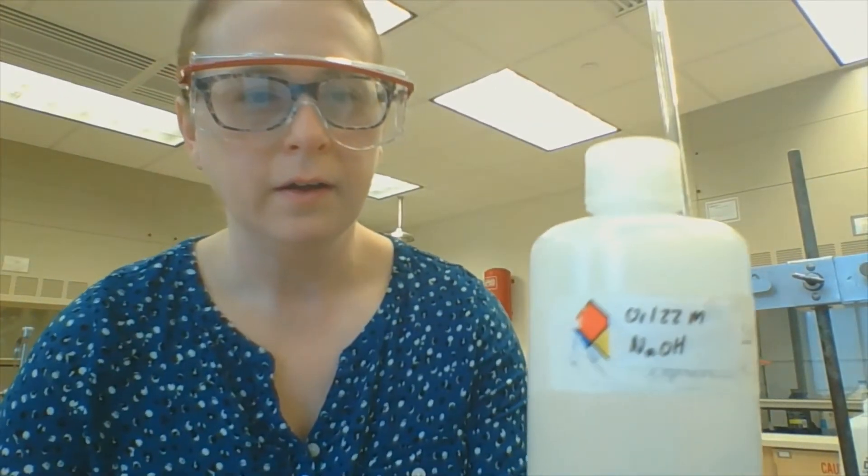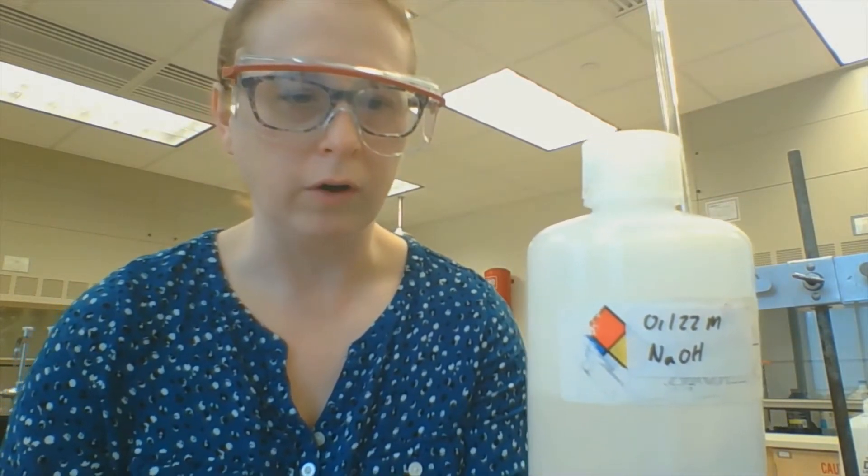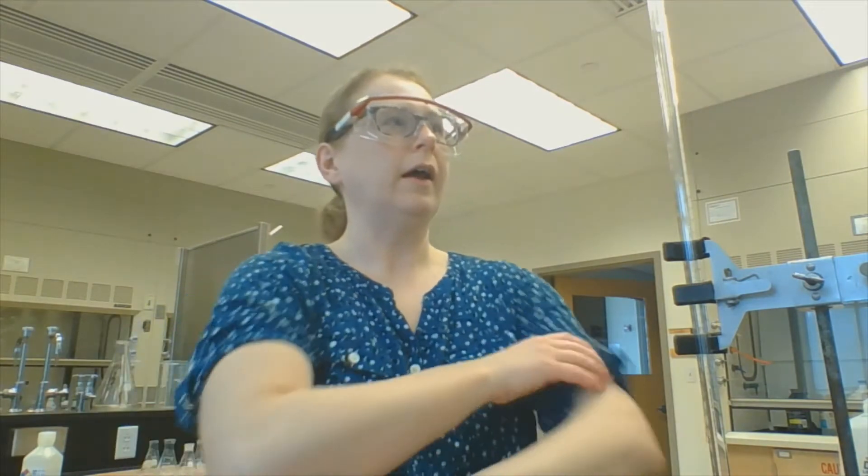My sodium hydroxide supposedly came out of a carboy that says it's 0.122 molar. However, sodium hydroxide over time actually degrades a bit — you get some oxidation and some reaction with water, so it might not be 0.122 molar. I'm going to fill this burette with sodium hydroxide and standardize it to make sure I know exactly what the concentration is.